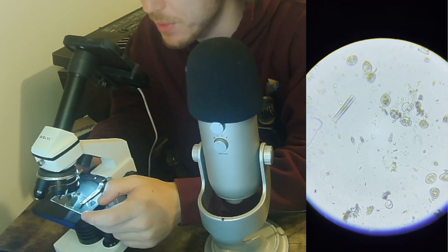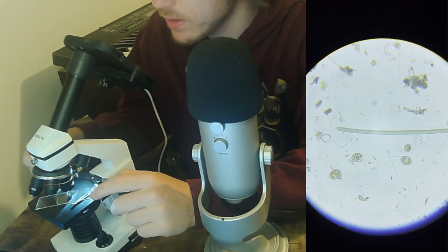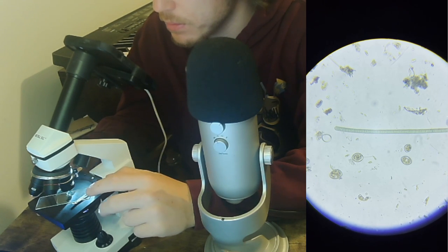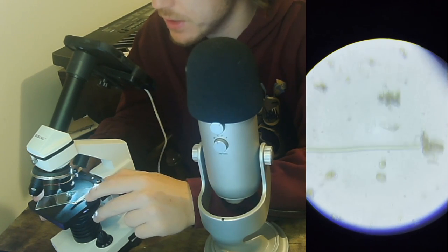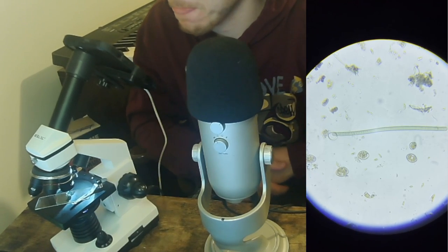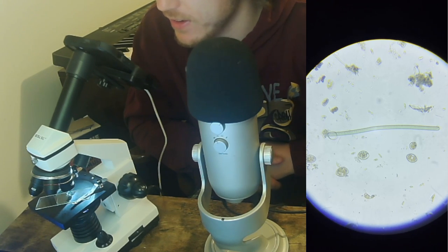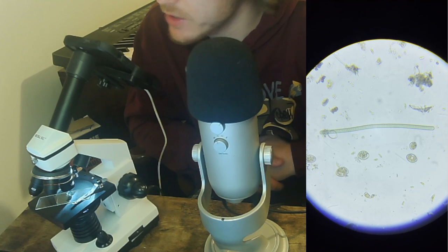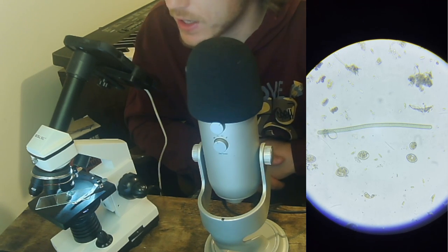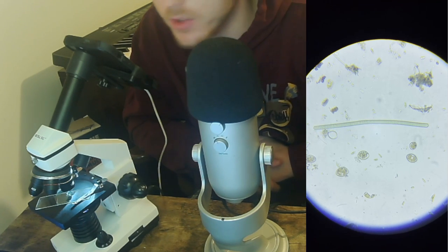Look at that unique rectangular shaped diatom. And right in the middle of course is one of the spinny guys, which we've been seeing everywhere. I love the spinny guys, they're so fun. Well look at this guy! Must be a worm or something of some sort. He's like perfect, he's like this perfect smooth green. But look at the way that he drifts through the water.